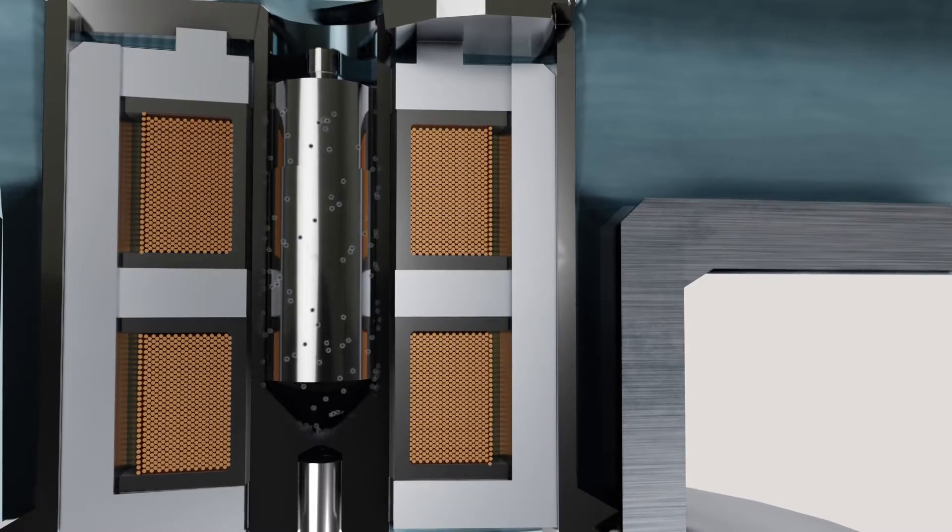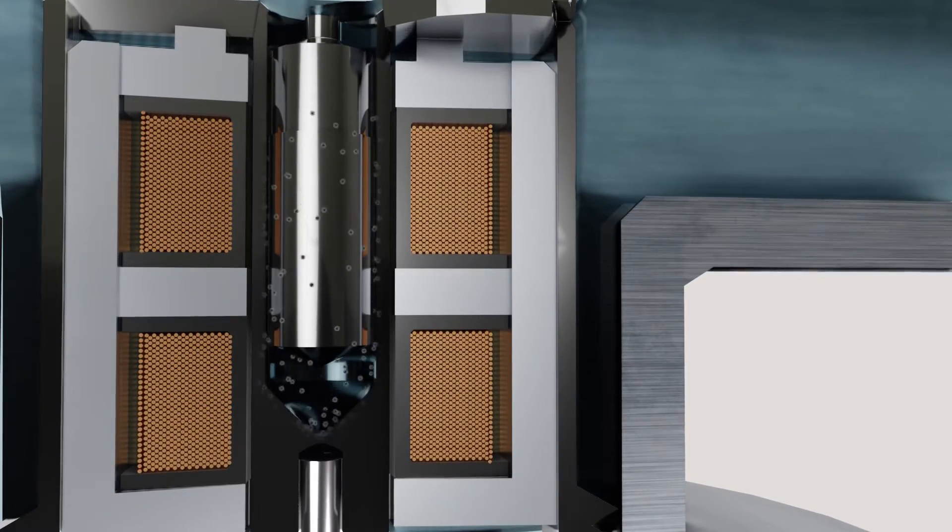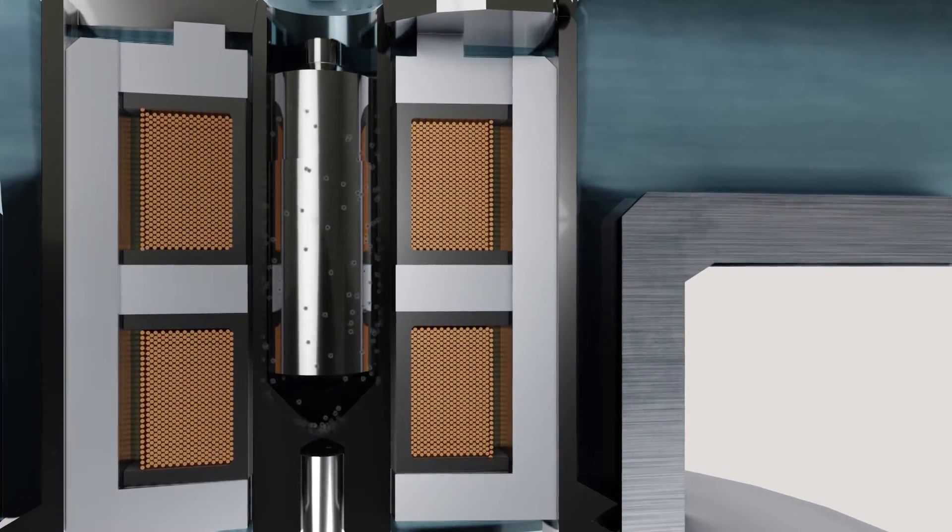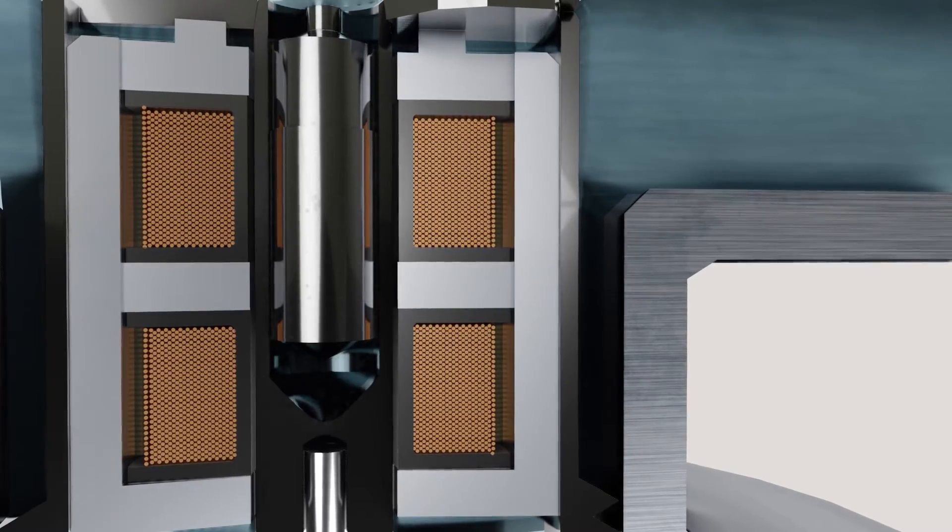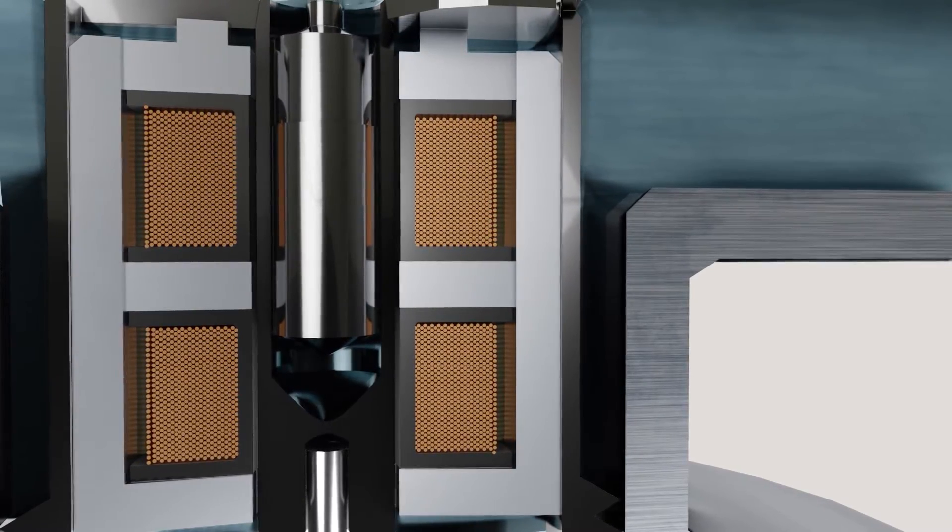The electronics can also provide the current shear rate at the measured viscosity.